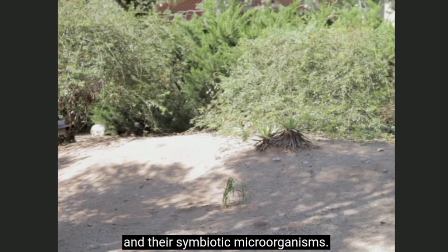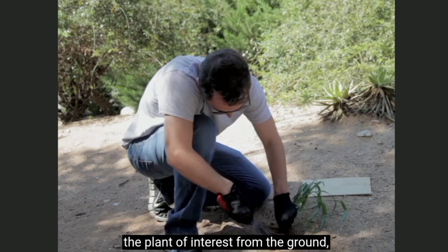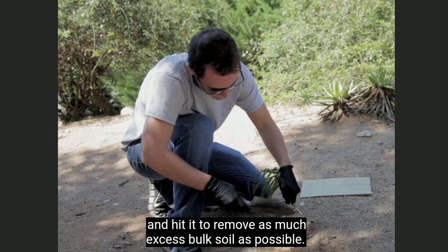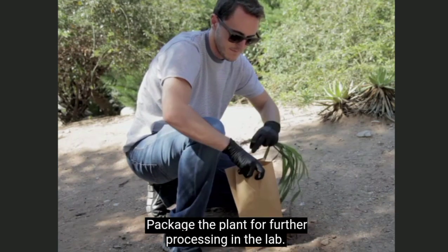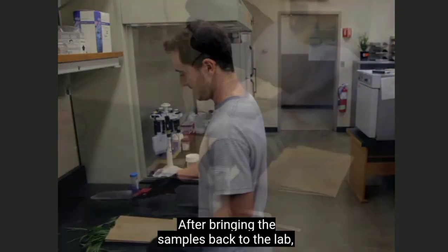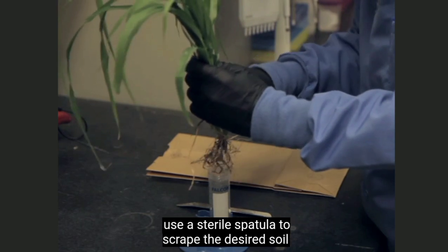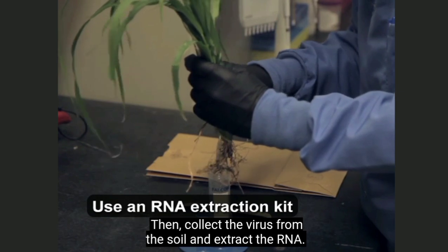To collect rhizosphere soil, first carefully extract the plant of interest from the ground and hit it to remove as much excess bulk soil as possible. Package the plant for further processing in the lab. After bringing the samples back to the lab, use a sterile spatula to scrape the desired soil into a collection vessel. Then collect the virus from the soil and extract the RNA.